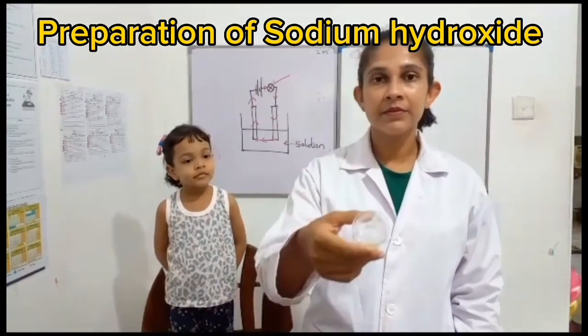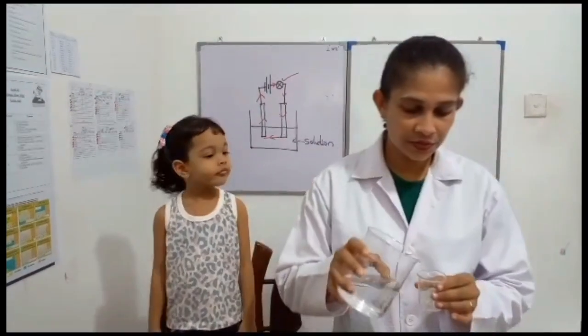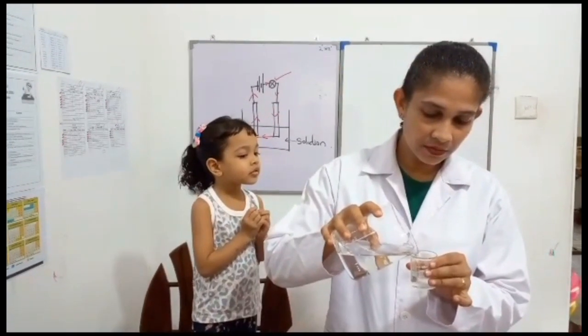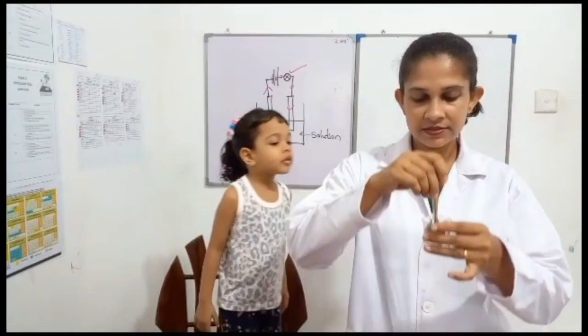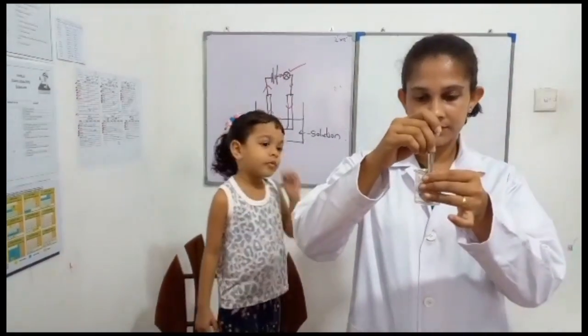I took some sodium hydroxide crystals into this beaker to prepare sodium hydroxide solution. I add some water and dissolve the sodium hydroxide crystals to prepare an aqueous solution of sodium hydroxide.